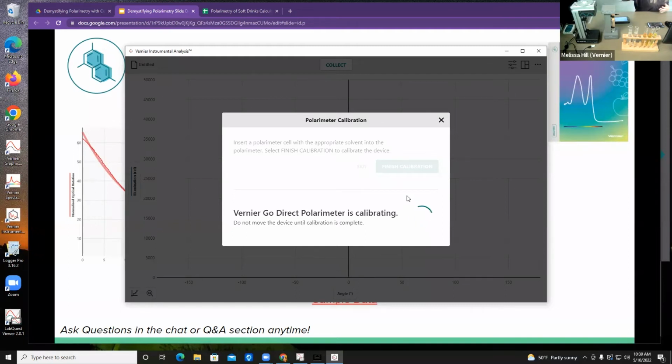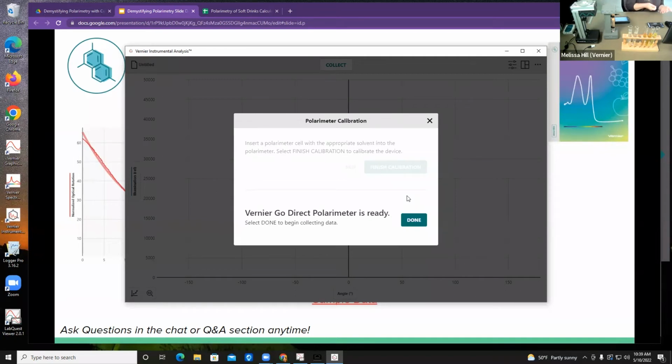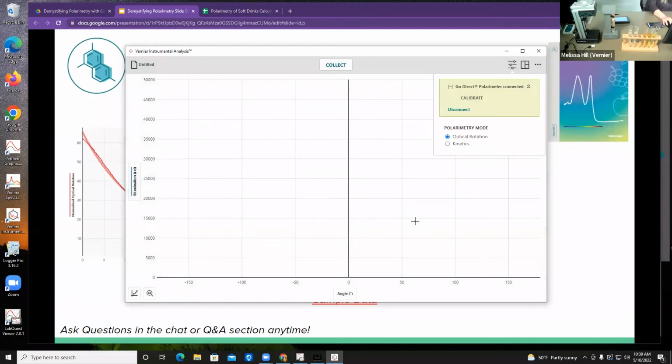To do a kinetics experiment with the older polarimeter, where the student just moves the analyzer, you have to have the student record the time, say 1 minute after start, and then do the whole manual rotation. You get that cosine squared waveform, and then you have them calculate the observed rotation, and then they plot it manually themselves, which is fine. It's a great way, and a good skill for students to learn.